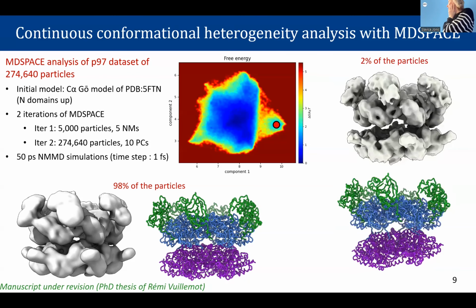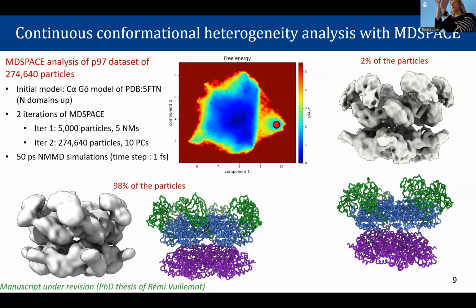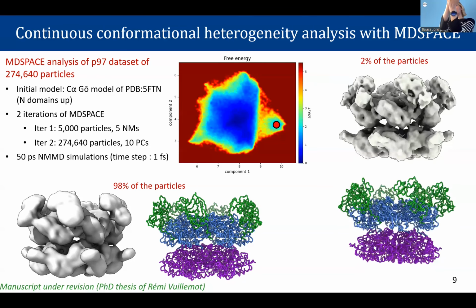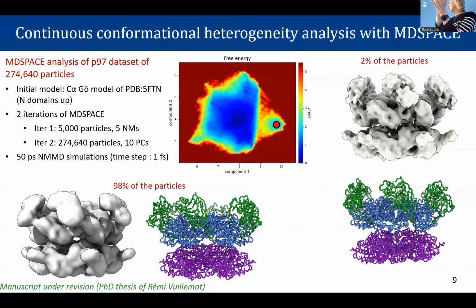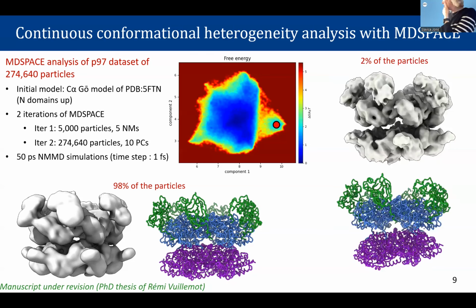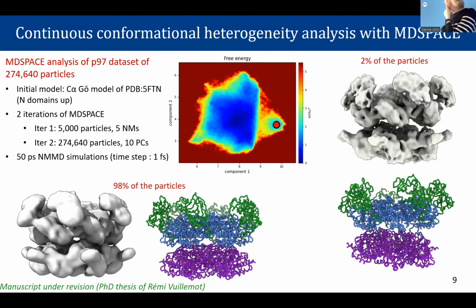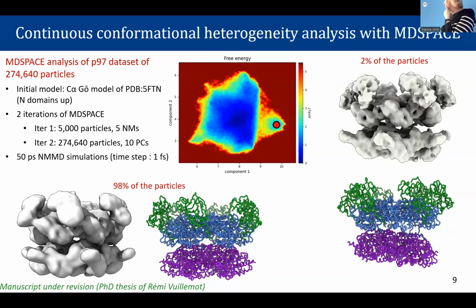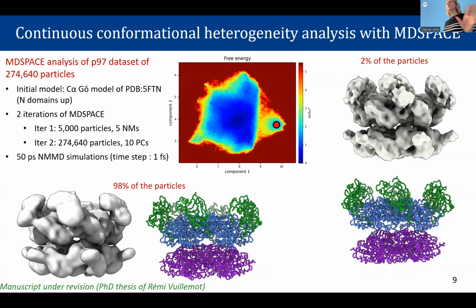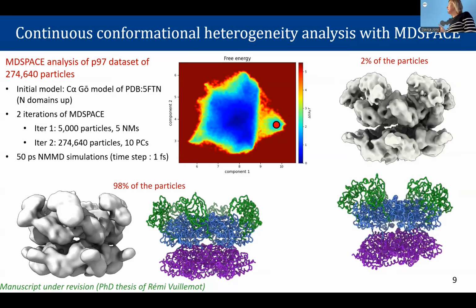So here maybe you see better. The two N domains are a little bit separated asymmetrically. So there is this gap, asymmetric. And the N domains, I don't know, Remy here showed them as if they are not moving, but I believe they are also moving. Okay, so just for people who don't know, this is what we call EMAP.